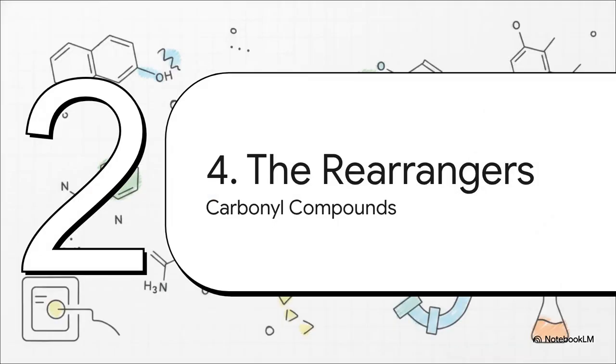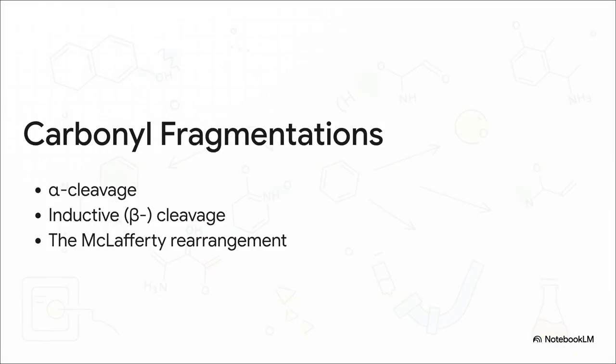Let's dive into Section 4, the rearrangers, carbonyl-containing compounds. Carbonyls, so we're talking aldehydes, ketones, esters, and carboxylic acids. They share some common one-bond fragmentations, but they are absolutely famous in mass spectrometry for undergoing some serious atomic gymnastics.